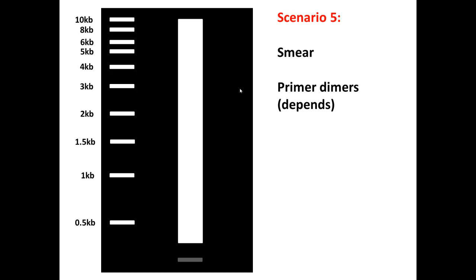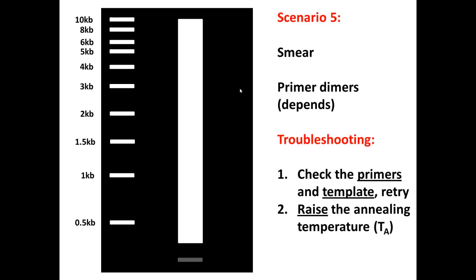Okay, scenario five, we have a smear. Now I personally have not seen this very often. I know people that have seen this fairly often, so I guess it really depends. In my opinion and my experience when I have seen it, this is some serious issues with your primers or templates that can cause severe non-specific amplification. So please check your primers and your template to make sure they're okay. This could also just be a case of you need to raise the annealing temperature to limit this really bad non-specific binding.